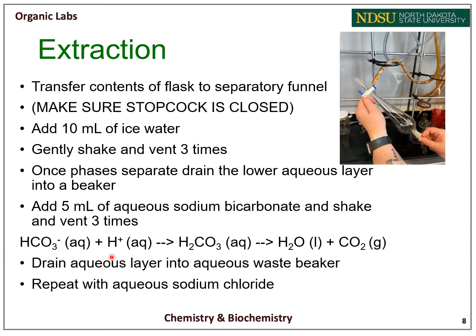Bicarbonate reacts with the excess acid that is still present and will form carbonic acid. The carbonic acid will decompose, which will form water and carbon dioxide gas.